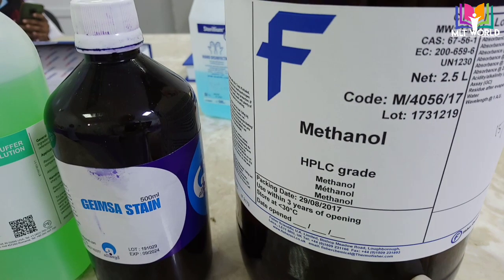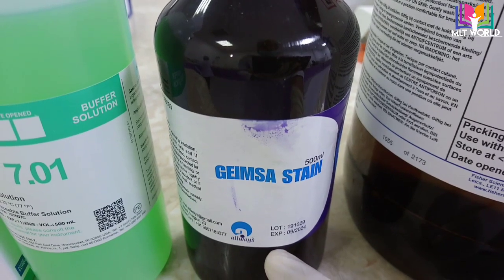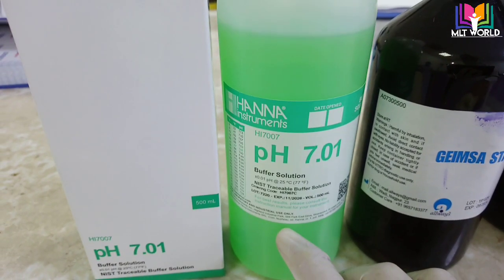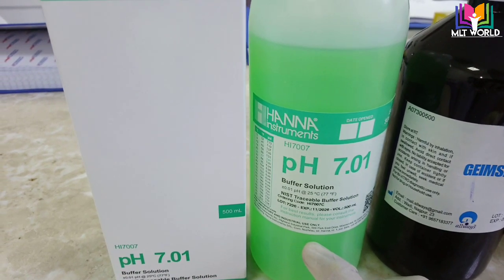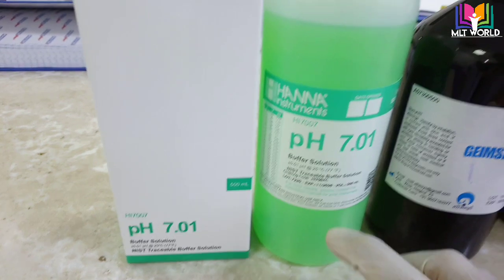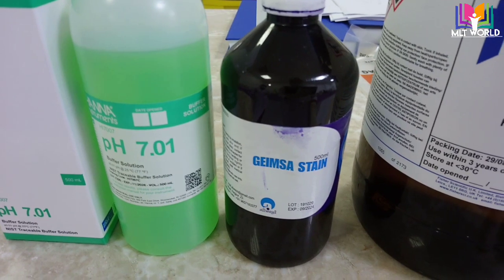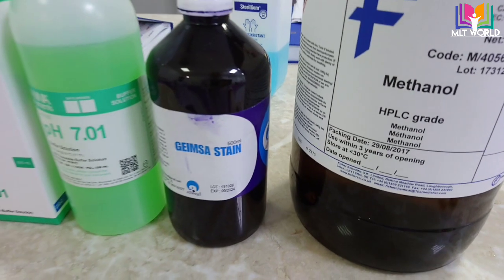First, this is methanol; second is Giemsa stain; and third one is buffer. We have to dilute the Giemsa stain with buffer before it's ready to use — otherwise you cannot use it directly to stain the smear. This buffer has a pH of 7.01. Different brands of buffers are available in the market, so you can use any brand suitable for Giemsa stain. There are other stains also that can be used for blood smear, like Leishman stain, but Giemsa stain is best for reading malarial parasites.